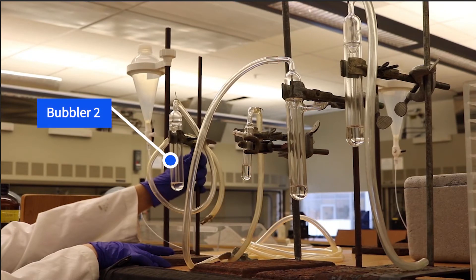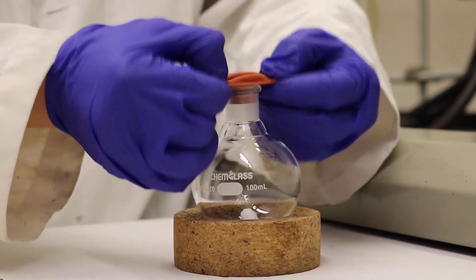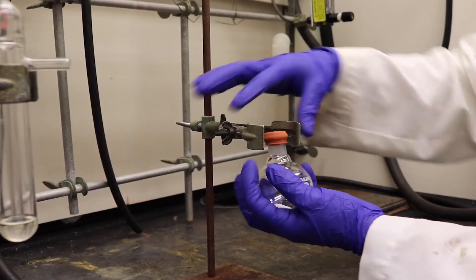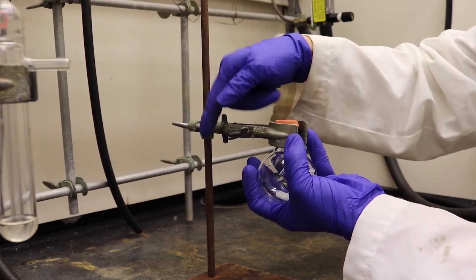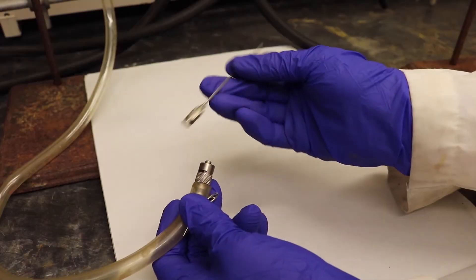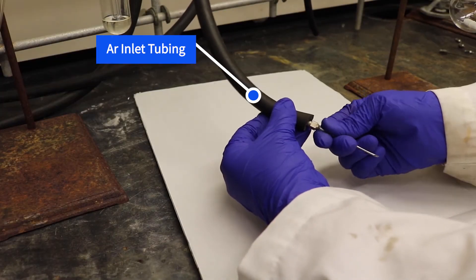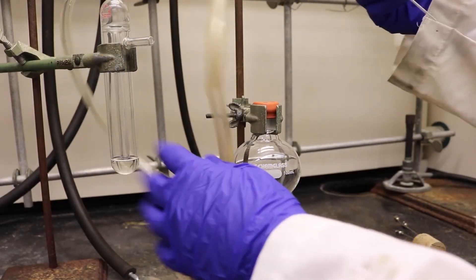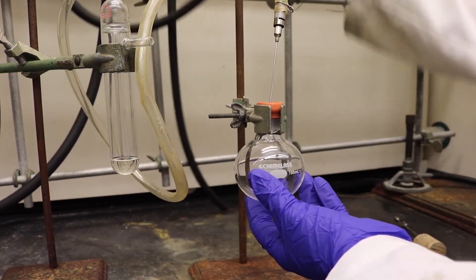Obtain a second bubbler and bring it to the manifold hood. This bubbler is used to make sure the argon gas is traveling to the round bottom flask. Place the magnetic stir bar into the round bottom flask and position the septum over the opening. Secure the round bottom flask onto a ring stand by aligning the neck of the flask with the clamp, and hold onto the clamp while tightening the screw clockwise. Extend a needle from the instructor for both the argon outlet and argon inlet tubing, and insert both needles into the septum. The outlet is connected to the second bubbler while the inlet is connected to the manifold.